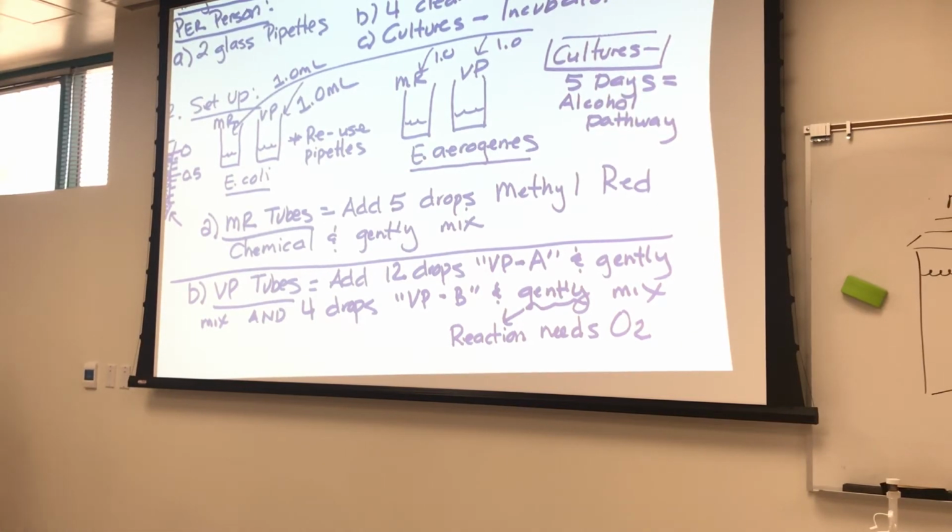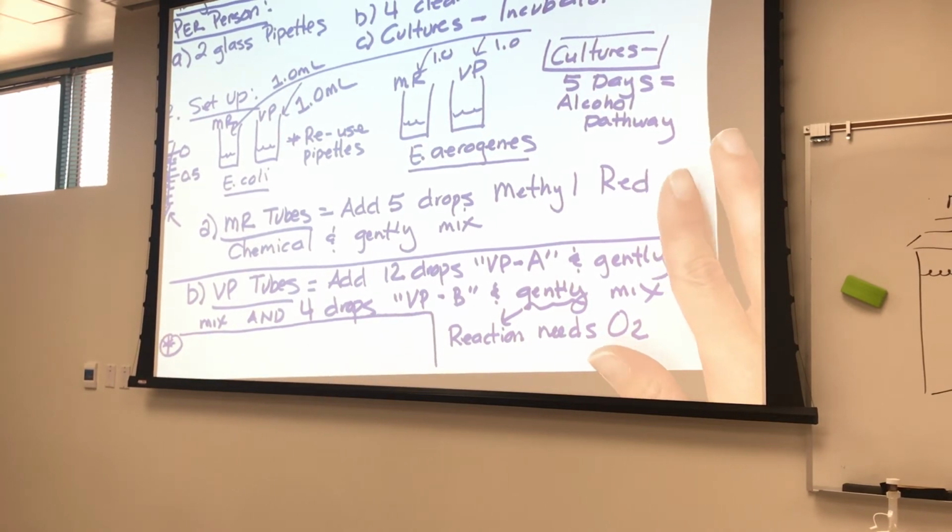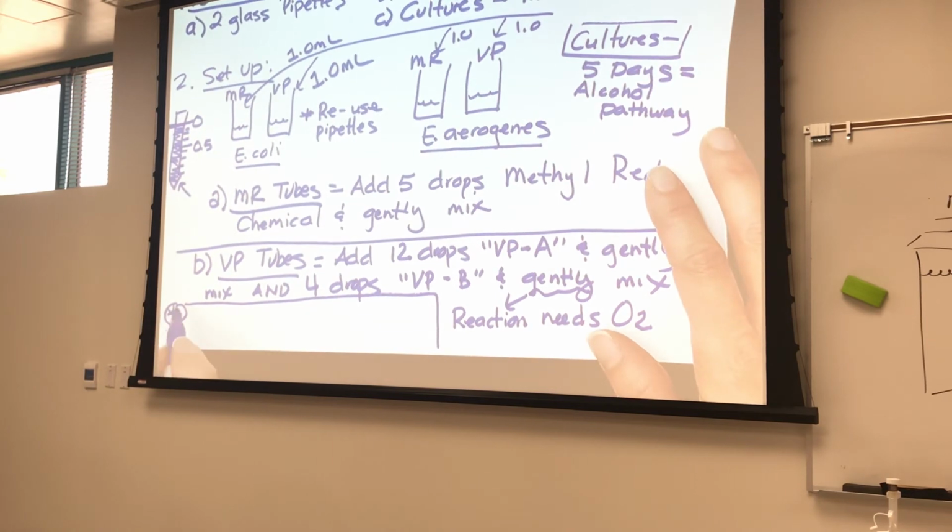But what I've noticed over the semesters is that you also don't want to do a violent shake, if that makes sense.